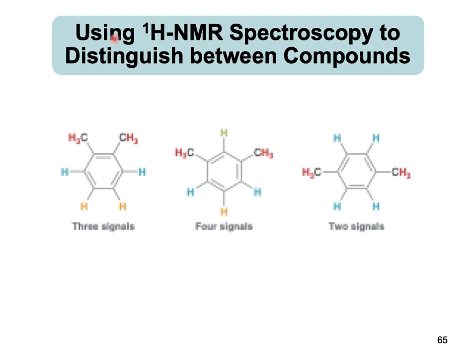So we are using proton NMR spectroscopy to distinguish between compounds. You see these methyls are ortho to each other, this one is meta, and this one is para, right? How many signals, different types of protons? 1, 2 and 3, right? In this compound, how many different types of protons? 4. Why? Same chemical environment. 1, 2, 3 and 4, because of the influence of this methyl it has a different chemical shift.